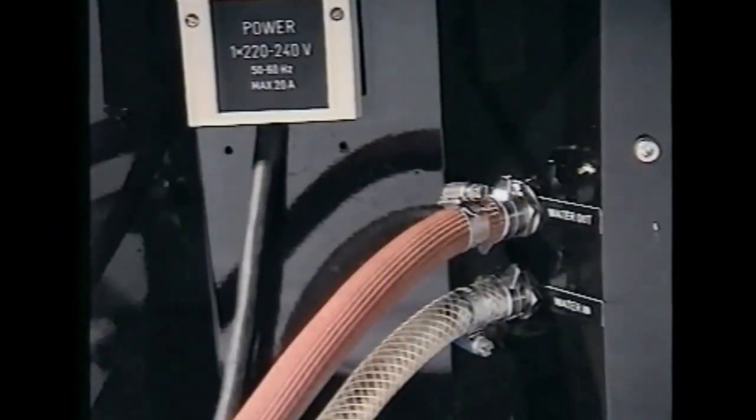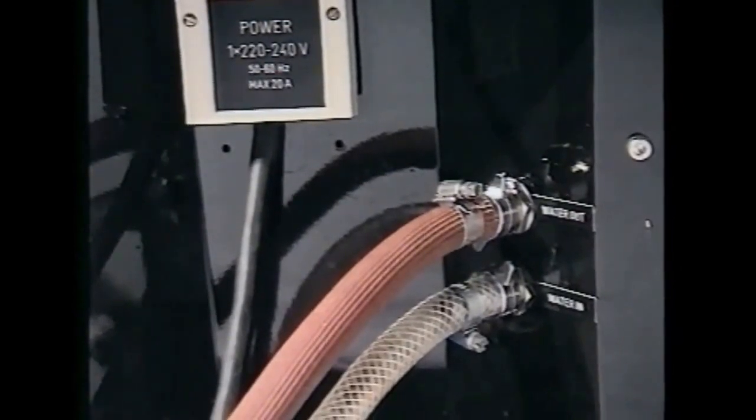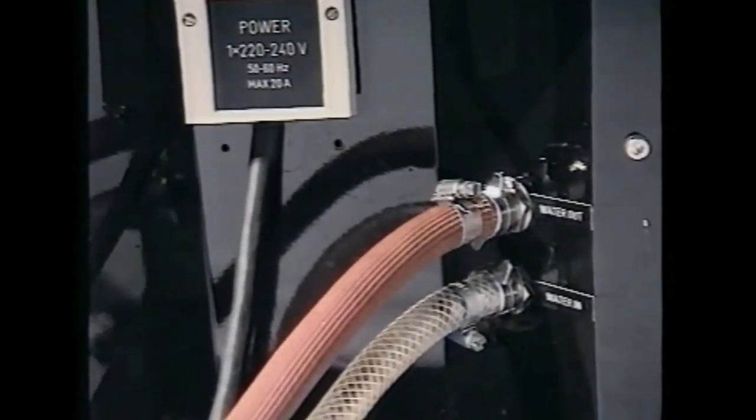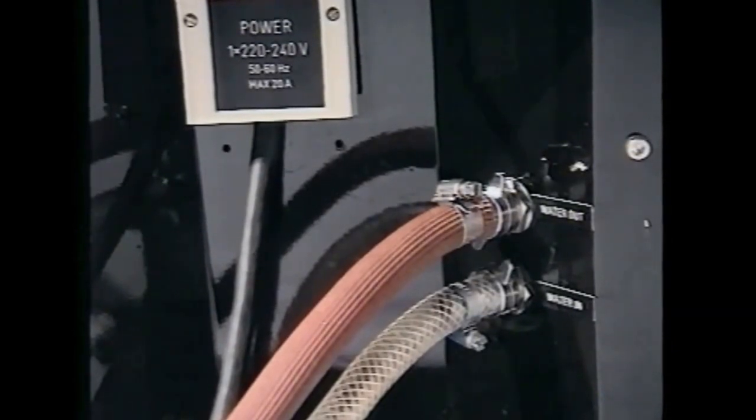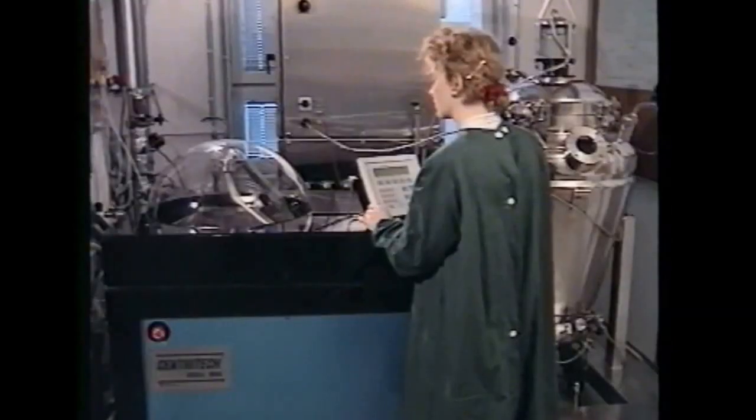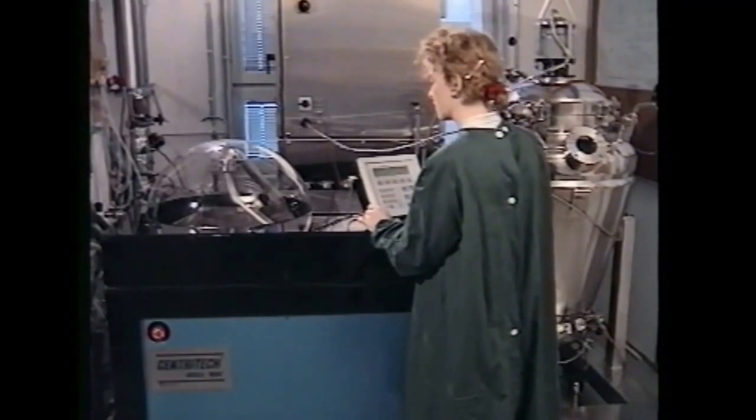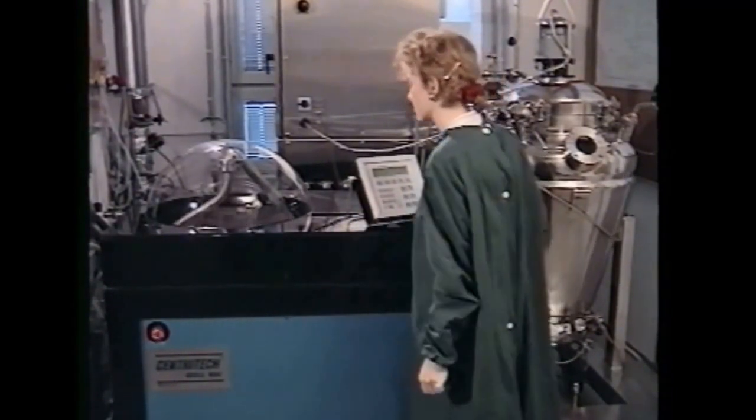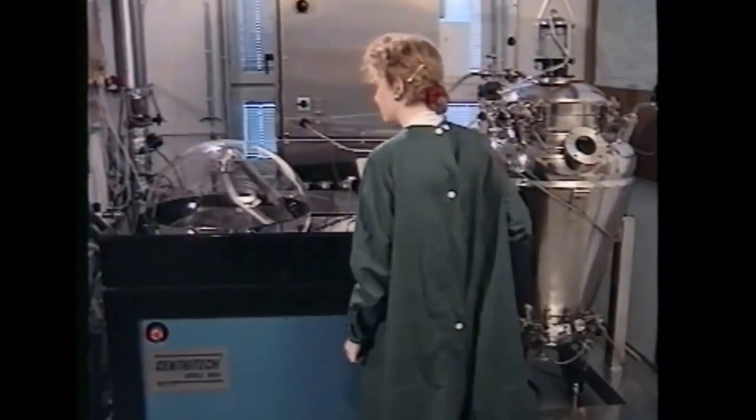The system is almost totally self-contained. The only external supplies required are electricity and water for the cooling system. This also allows very simple relocation of the equipment and rapid resumption of operation on the new site.